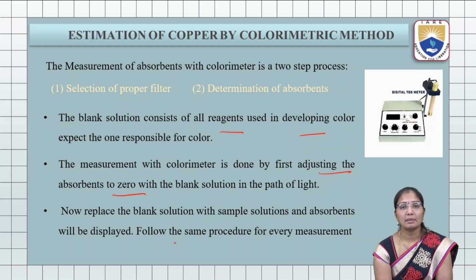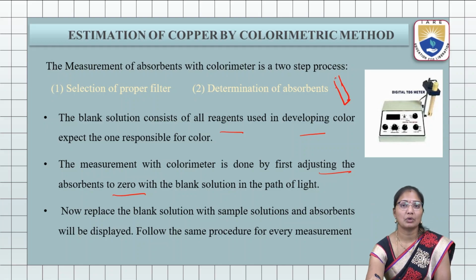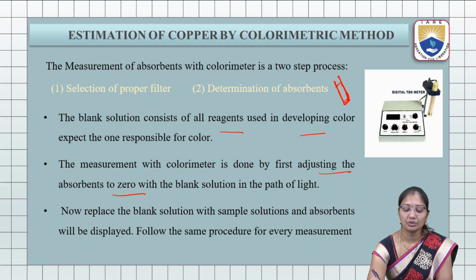Now take out the blank solution and keep the standard solution in the cuvette holder. For colorimetry we use cuvettes. These are small test-tube-like apparatus where the solution is filled to 3/4 and inserted inside the colorimeter.